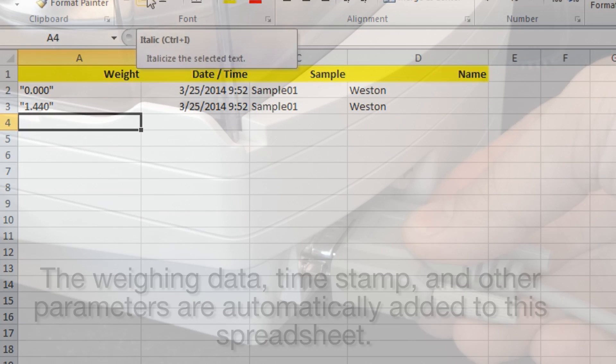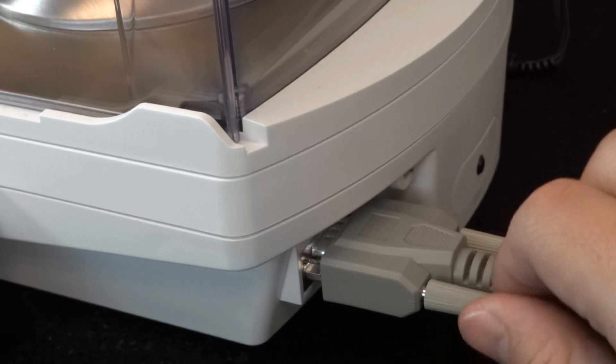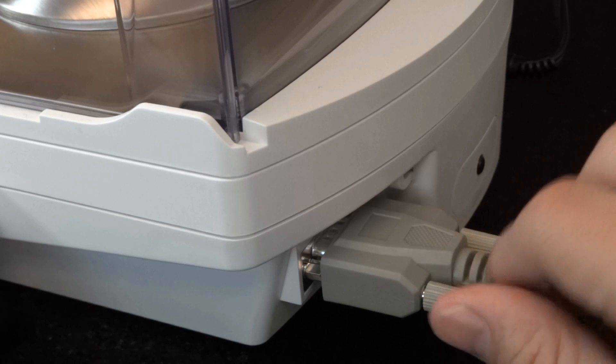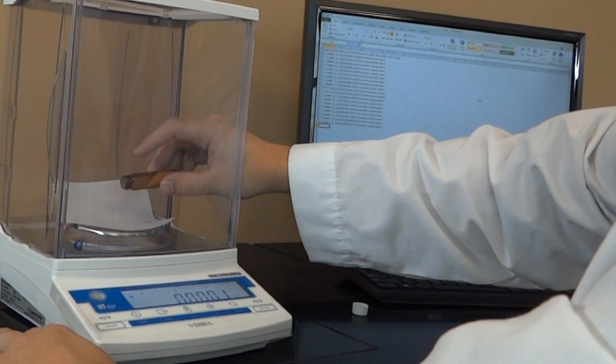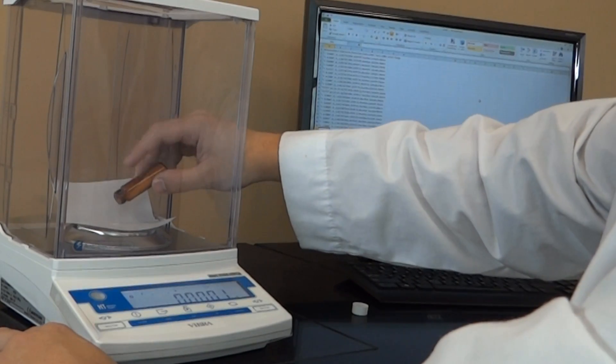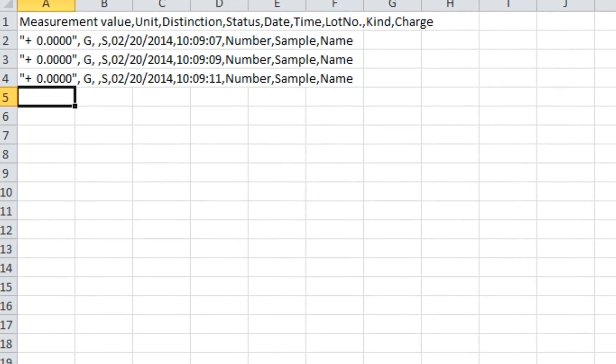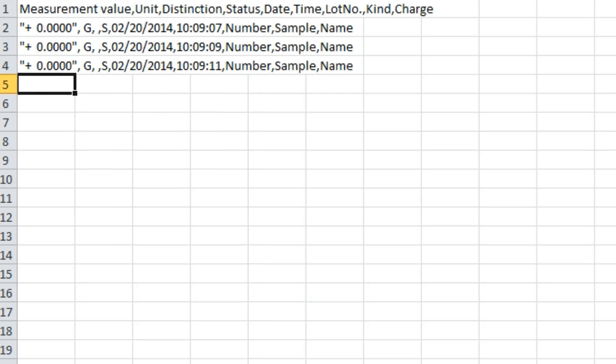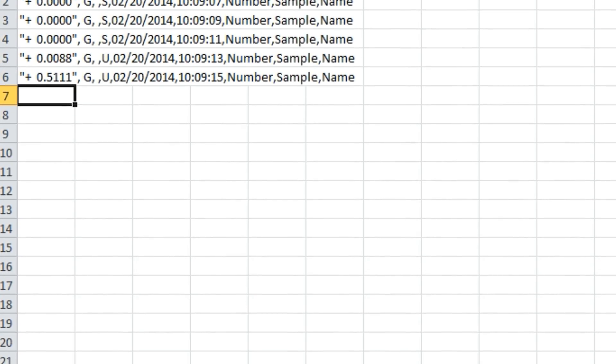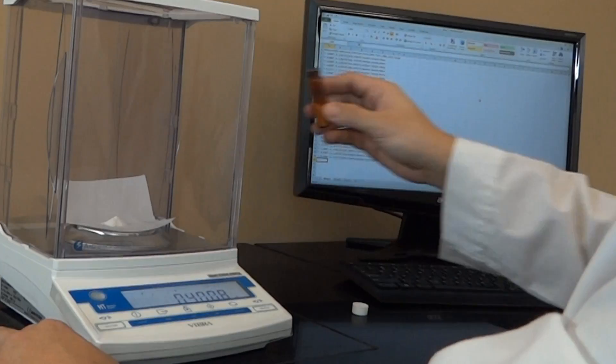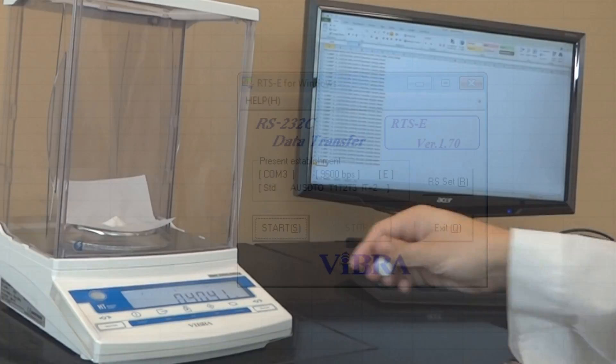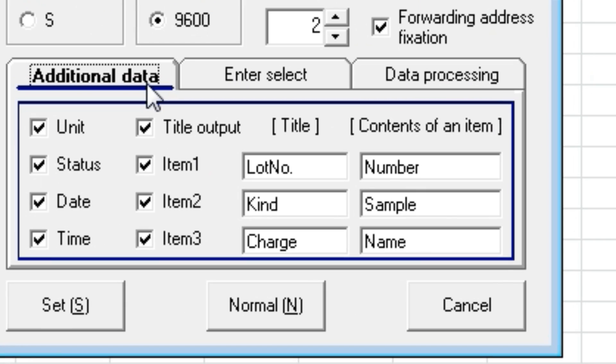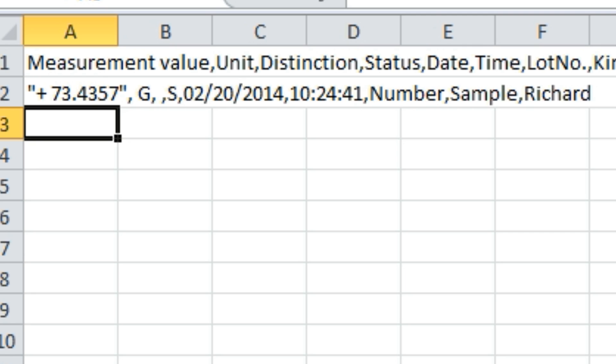Intelligent Weighing Technology provides scales and balances suitable for use with manufacturer-supplied or commercial connectivity software. A large number of our laboratory products include direct-to-Windows-based software applications as a no-charge download, which includes date and timestamps and lot and user numbers.